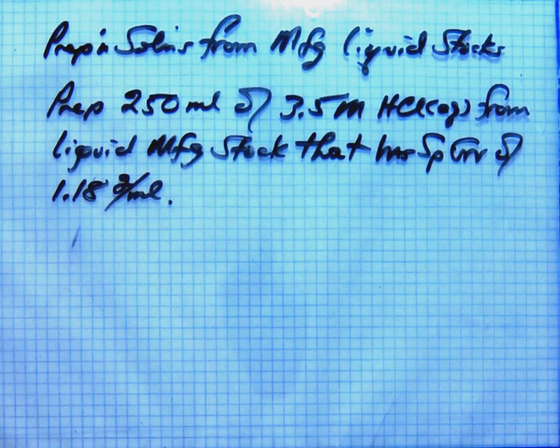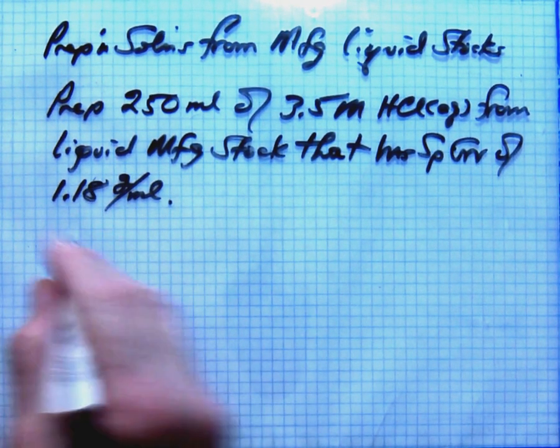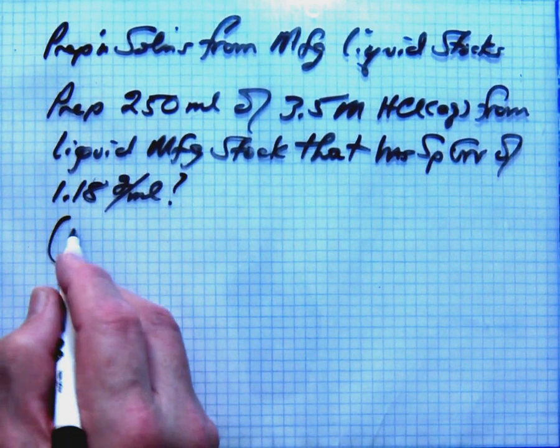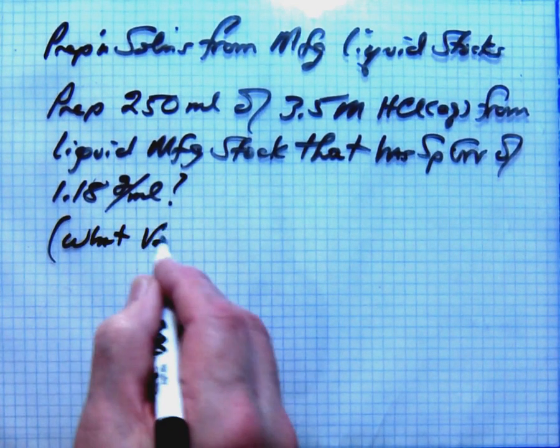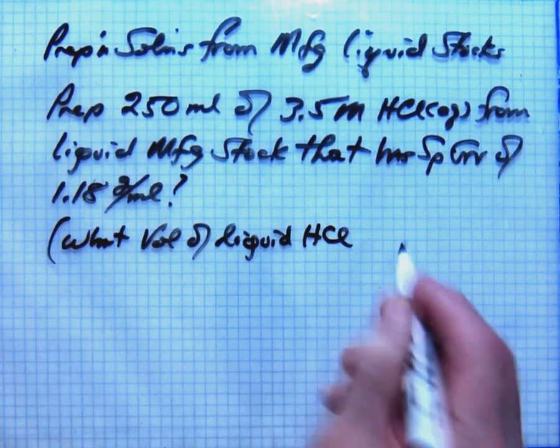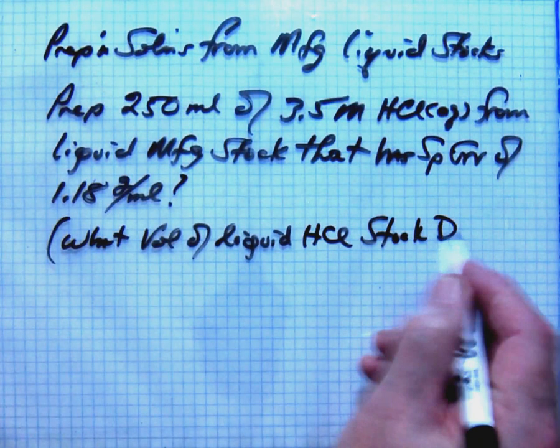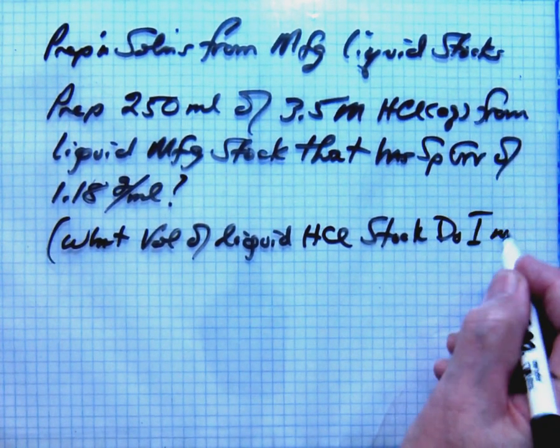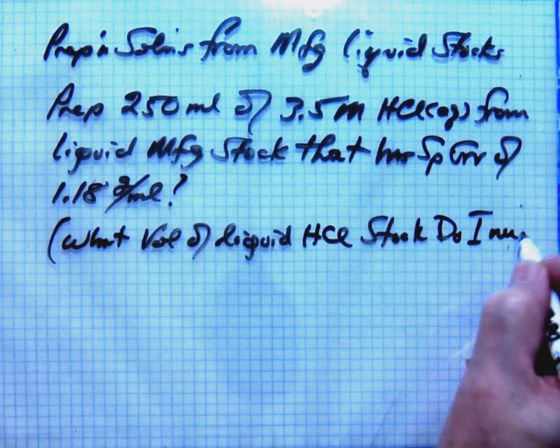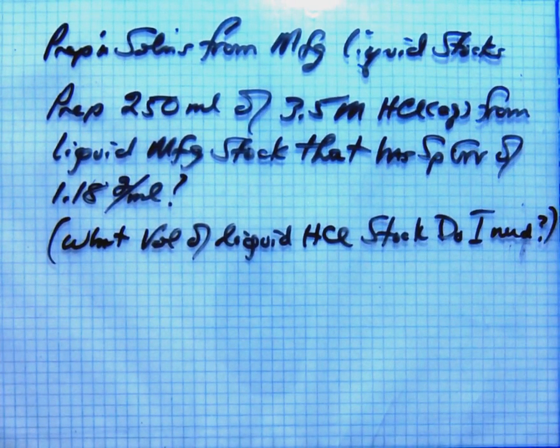How much of the HCl do you need to extract from that bottle? You'll be given this kind of problem, but intuitively you want to ask yourself, what volume of liquid HCl stock do I need? It's what you're in essence asking yourself when you make a solution from a liquid stock.